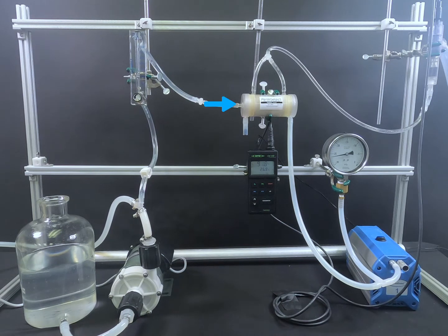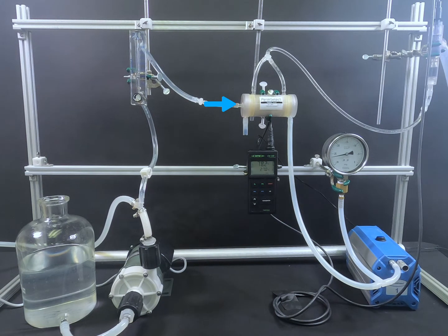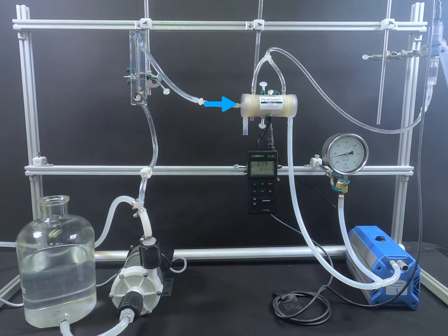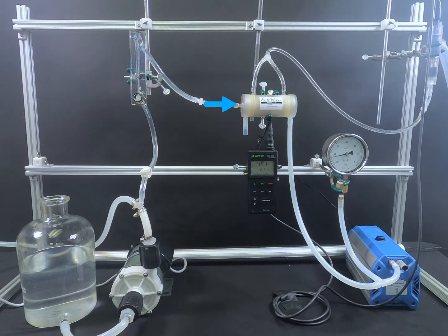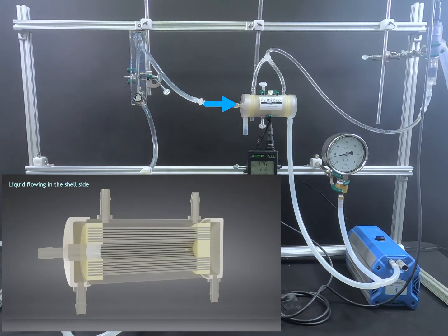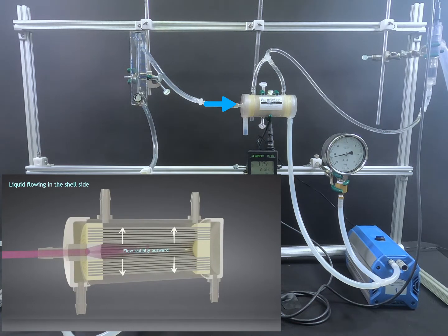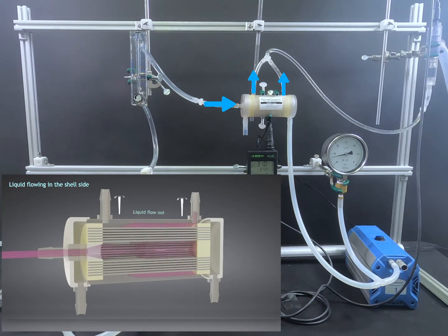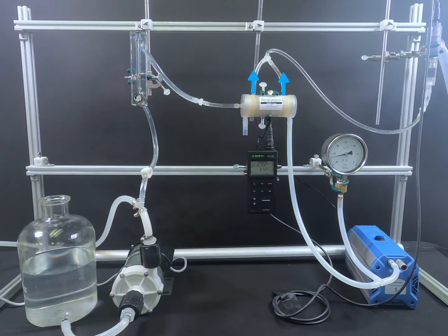As the water flows into the membrane module through the shell side, it enters the liquid in port and the water flows radially outward across the bundle of hollow fibers contacting one meter squared of our membrane surface and exits through the two liquid out ports on the top of the module.